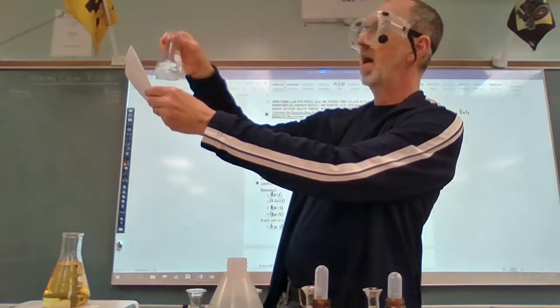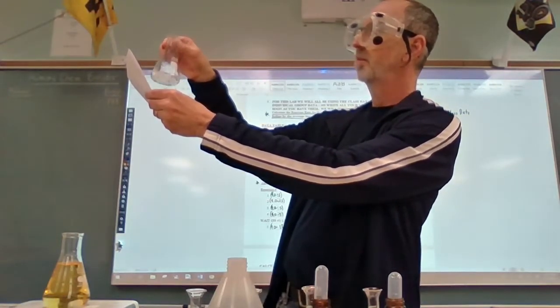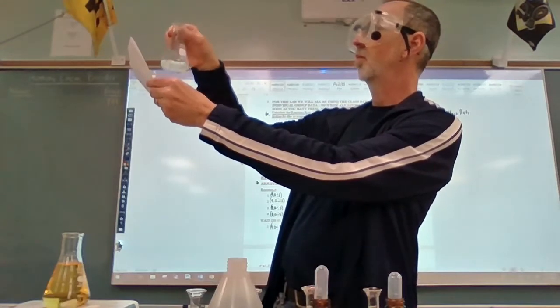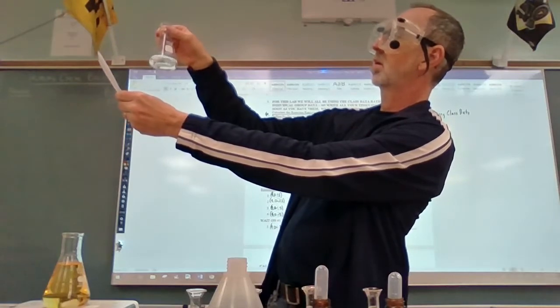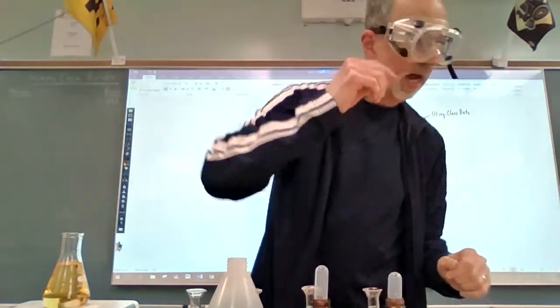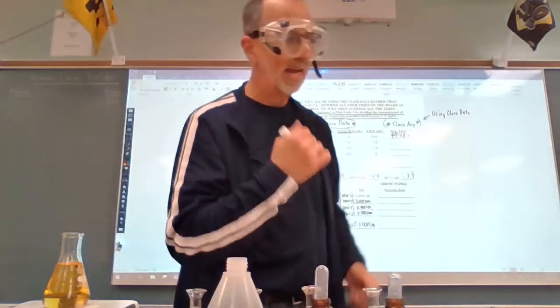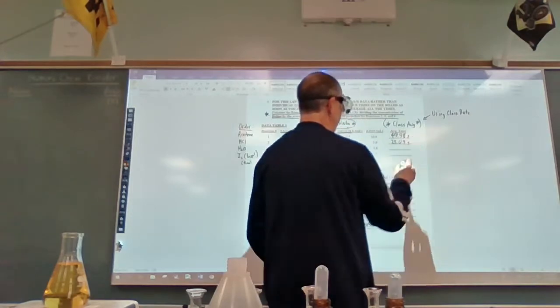Yeah, this one's going lighter, going more clear much more quickly. Boy, we're getting really close. I think we're there. Boom. Okay, I recorded 27.33 seconds. Again, using the class data from last year, that averaged out to 25.09 seconds.